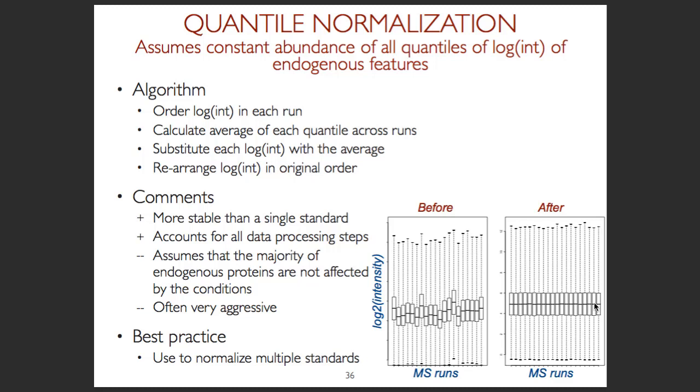In our experience, when we work with real data sets, I would say that this is the part which takes a lot of time. And I would probably argue that one of the reasons that in this ABRF study we had such a big diversity of results was probably due to diversity of normalization. How do you know which one is the best one? Once you normalize, is there a way to check how well it performs?